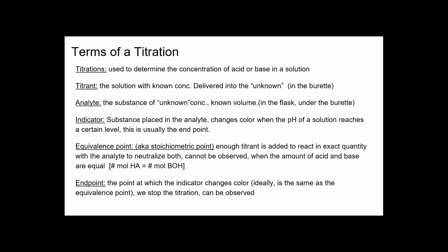Equivalence point. LabFlow refers to both of these, equivalence point and stoichiometric point. They are the same thing, but they use both, I think, to test you guys. So make sure you understand, it's the same thing. Enough titrant is added to react in exact quantity with an analyte to neutralize both. You cannot observe this chemical reaction happening.